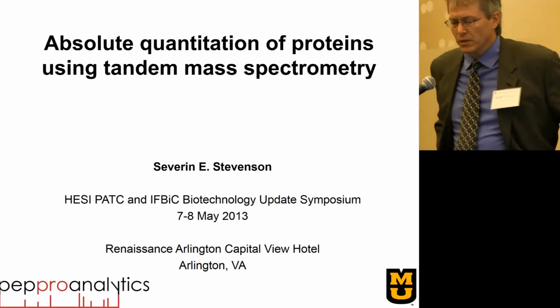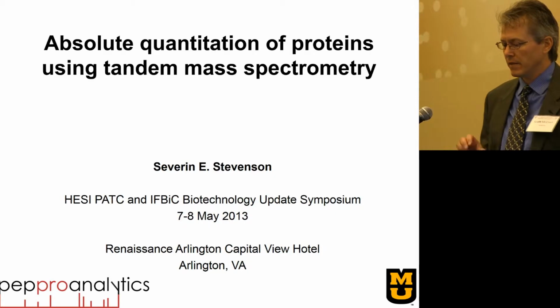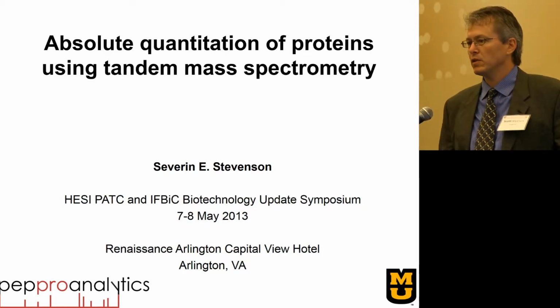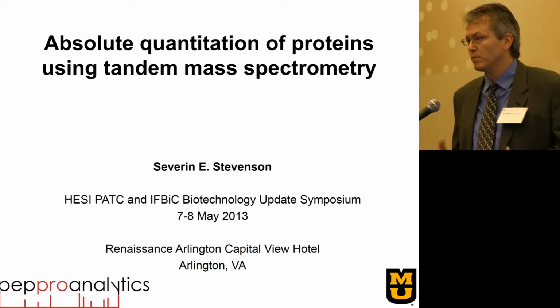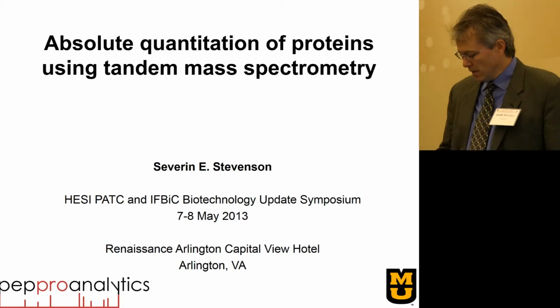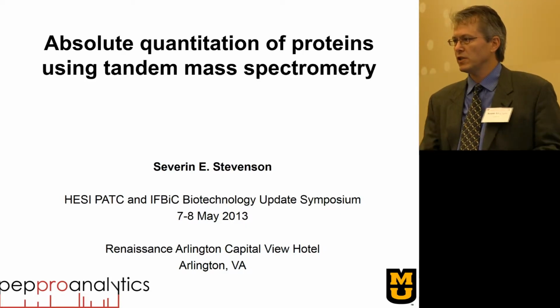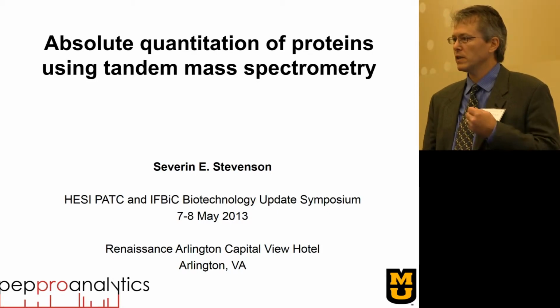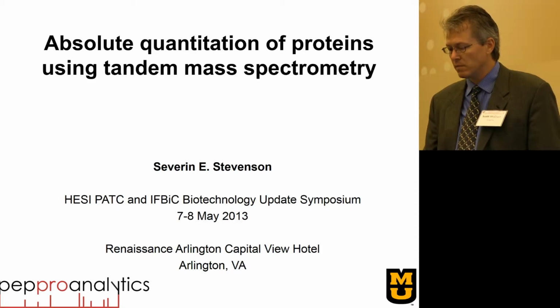Okay, so what I'll do this morning is I'll present another way that this group, PepPro Analytics and the University of Missouri, has developed in terms of thinking about a proteomic approach, but I would say a targeted proteomic approach to take a look at endogenous allergens. And so this is a nice presentation after Crystal's in thinking about the technology itself and asking the question, can I measure a targeted set of proteins in a complex matrix, which we have in the case of seed.